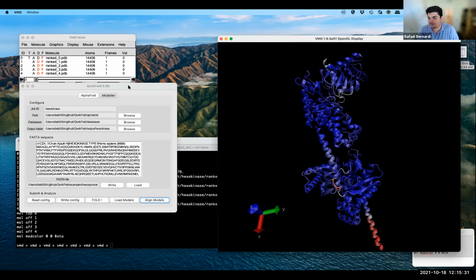Diego, we can still see your screen just in case. Hi, Rafael. Yeah, so there is no such option about selecting how many models you want, right? Not yet. Right now it's the standard default, which is generate one per database, like Diego was showing.